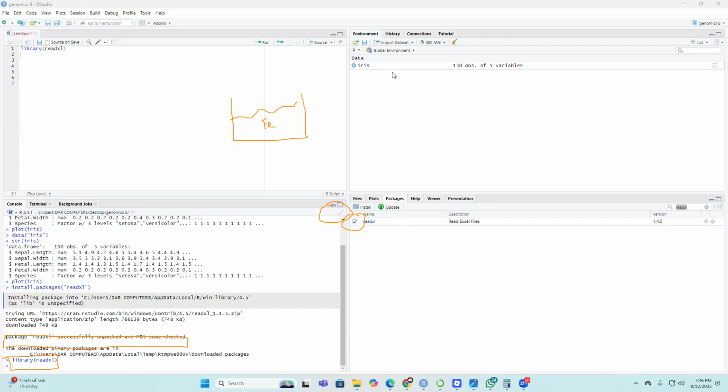Okay, now the next step is all participants please come to screen number 3 and click on the Import button. Below History there is Import Dataset. Click on this button. It will give you a list showing up to 6 names, from Text, from Excel.